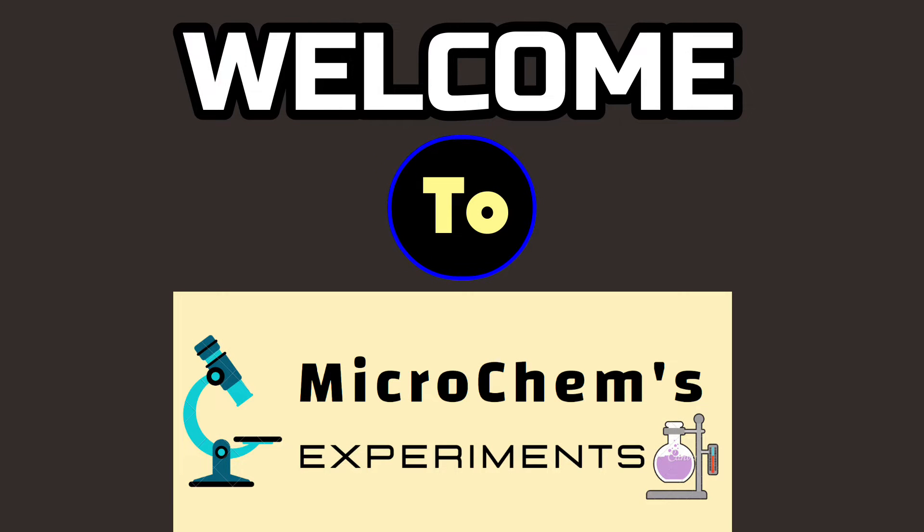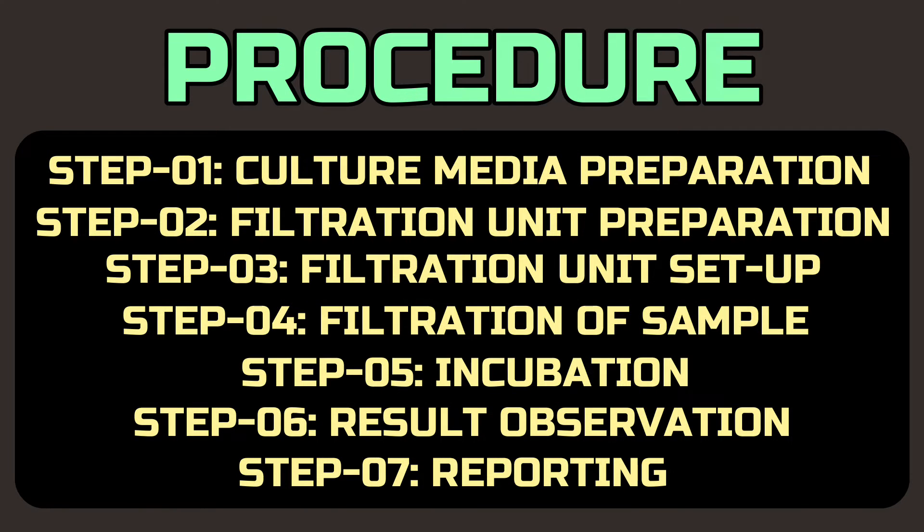Welcome to MicroKame's Experiments — be with us, be a laboratory expert. We divided the whole procedure into seven steps: culture media preparation, filtration unit preparation, filtration unit setup, filtration of sample, incubation, result observation, and reporting.